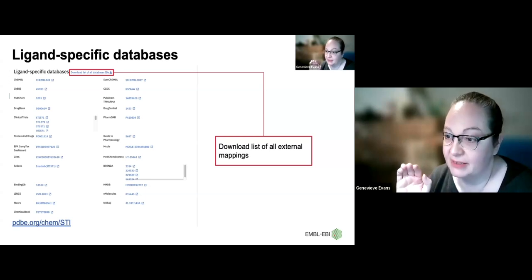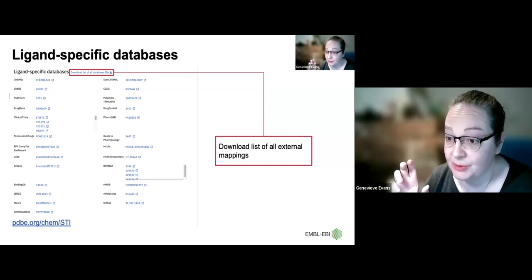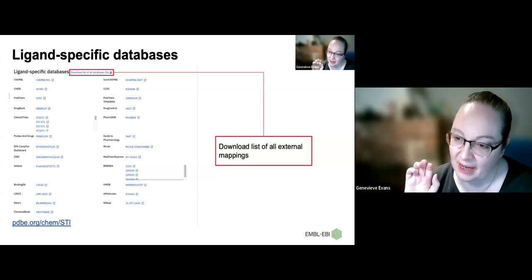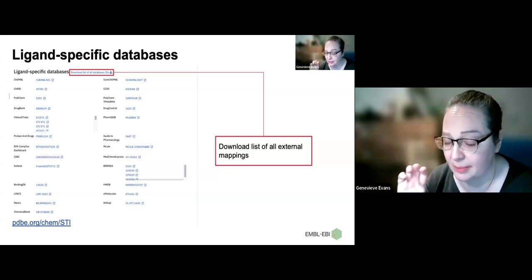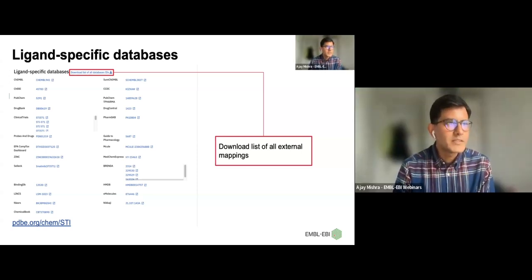So that being said, there are different ways in which we're highlighting scaffolds found within those ligands on these pages, and that may or may not be useful for you. But these are not docked ligands that have happened in silico. These are ligands that are present in those 200,000 structures in the database. Is there any database for nanoparticles acting as ligands?